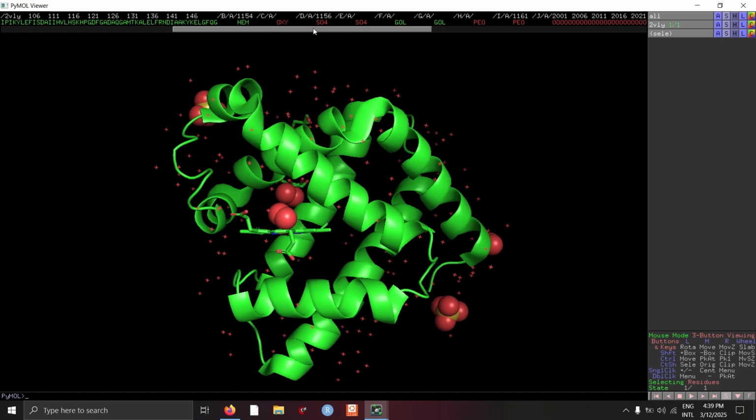As you can see in this file, there are many oxygen atoms scattered around the PDB file. Those oxygen atoms correspond to water molecules. But missing, you will find, are the hydrogen atoms. There are no hydrogen atoms in this structure. So if you wanted to, we could add those atoms in a later step.